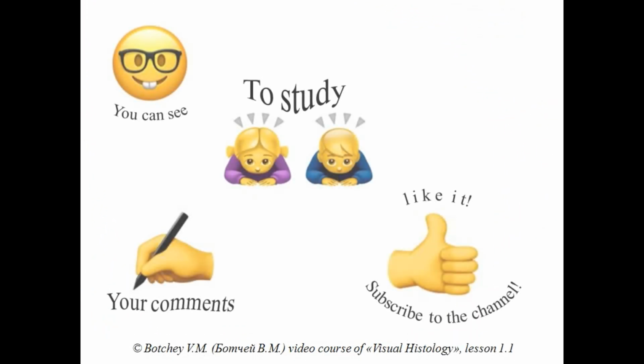Well, we discussed in detail the external structure of the light microscope and the algorithm of working with it. I hope this video helps you learn this process faster.